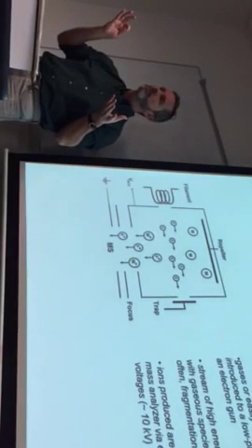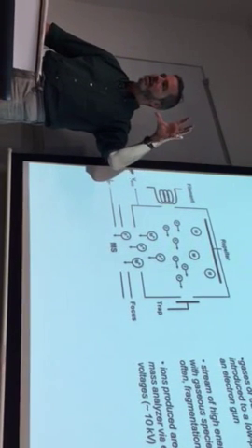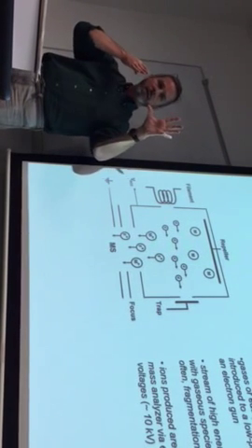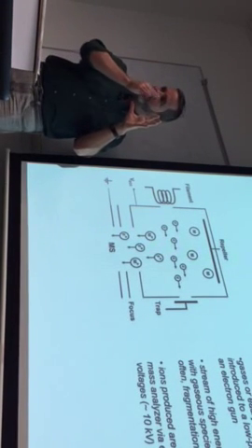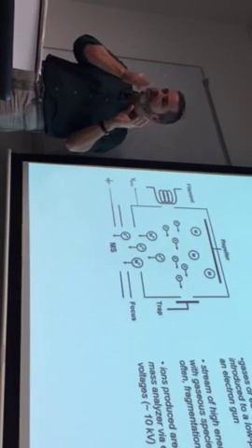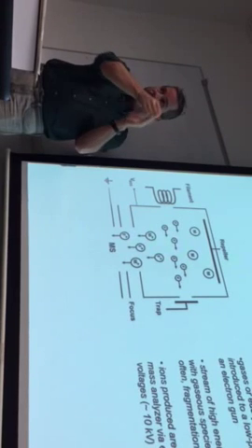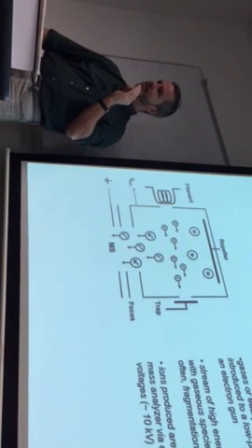the ones least tightly held. So imagine here's this big puffy valence shell electron cloud for some molecule, and here comes a high energy negatively charged electron, and it's a near miss. Can you imagine the repulsive forces? Likes repel, right? Negative, negative. It could be that the miss is near enough, and the energy of the electron zipping by is great enough, that it just blows off an electron. Can you think of it that way?